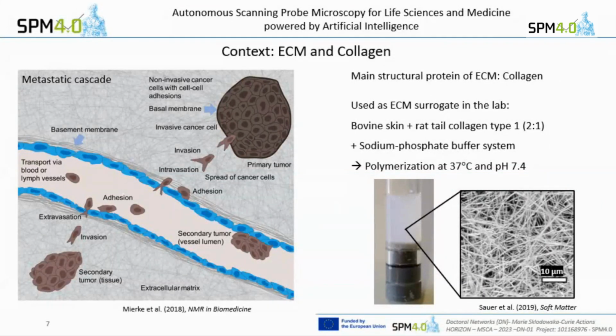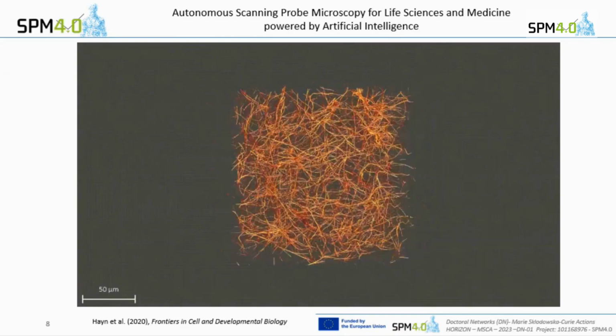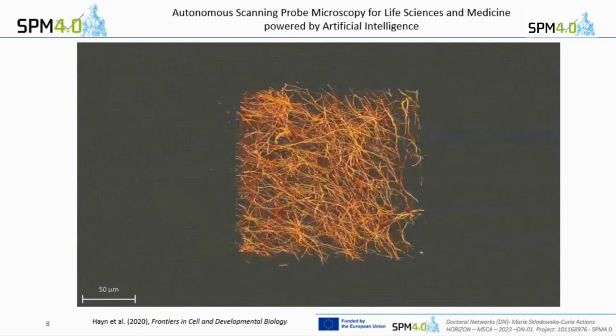If you do not want to image that fast and go more for quality imaging, you of course use some stain that here, for example, TAMRA, stains everything, but if your sample only contains collagen, it only stains collagen, right? And with that, you get an image that looks like this. So you also have a three-dimensional image cube, and you can see really nicely the collagen fibers here. This is from a publication of a colleague of mine.